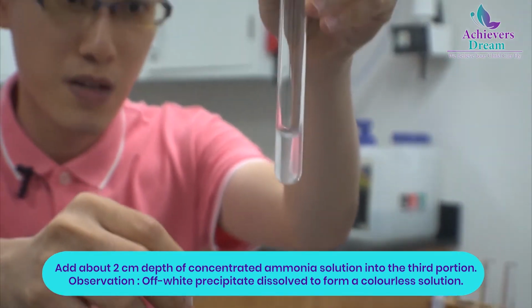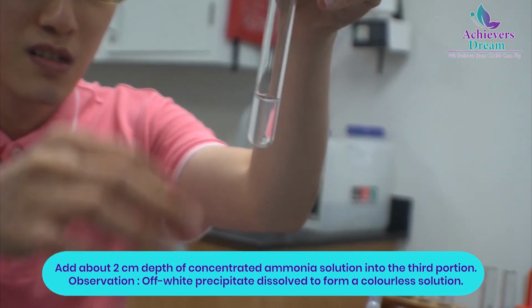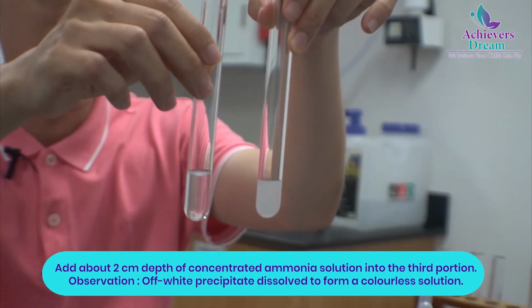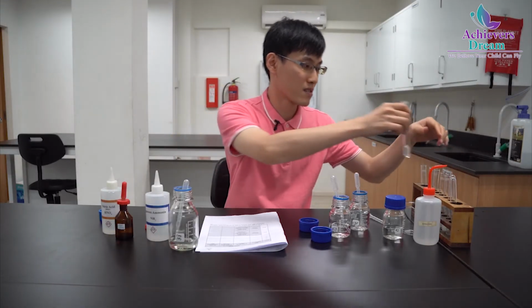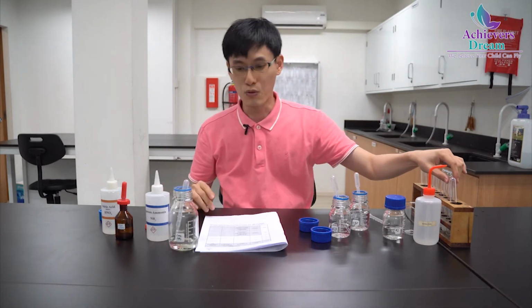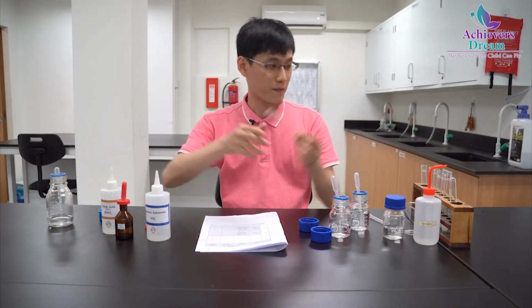It's becoming clearer. Contrast this with the earlier solution where I added dilute ammonia. Okay, so this is for silver bromide.